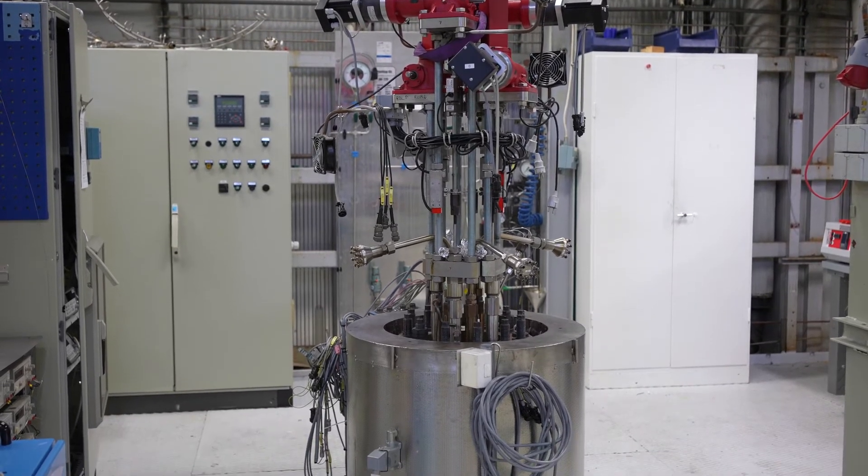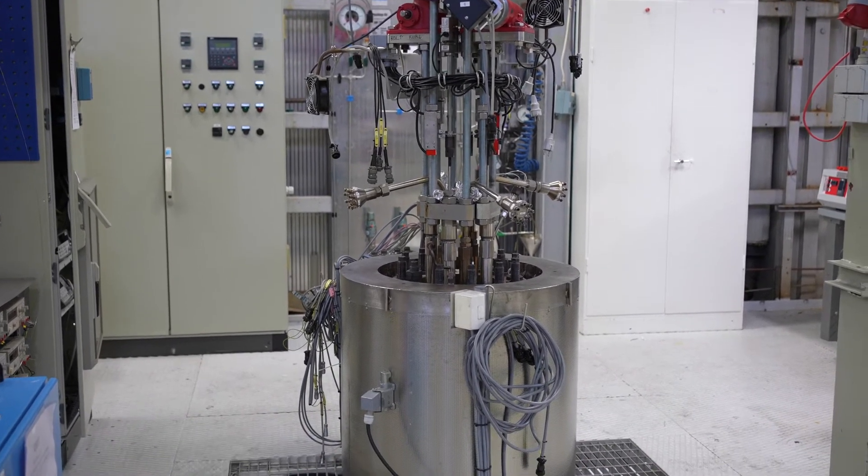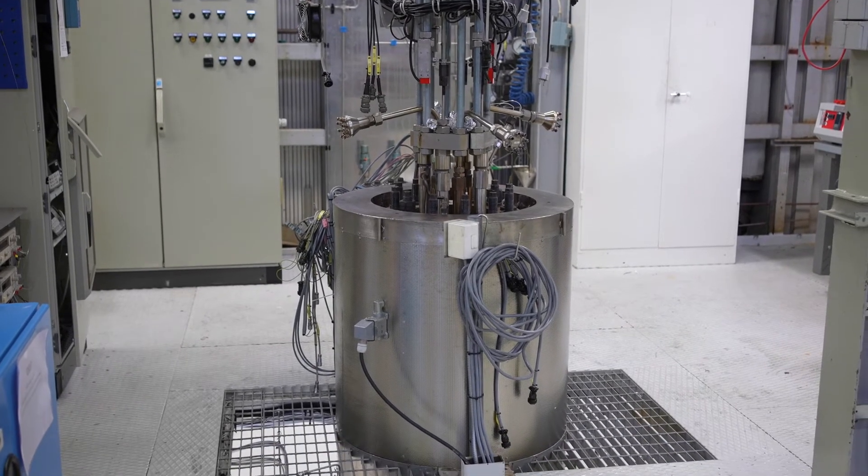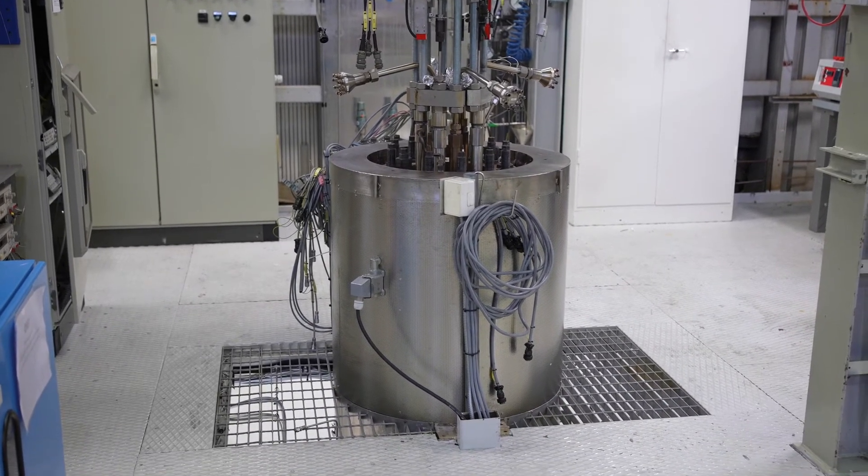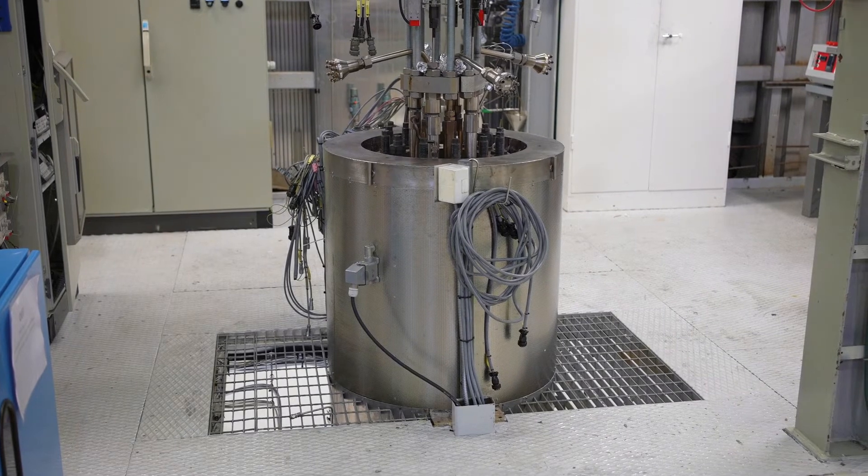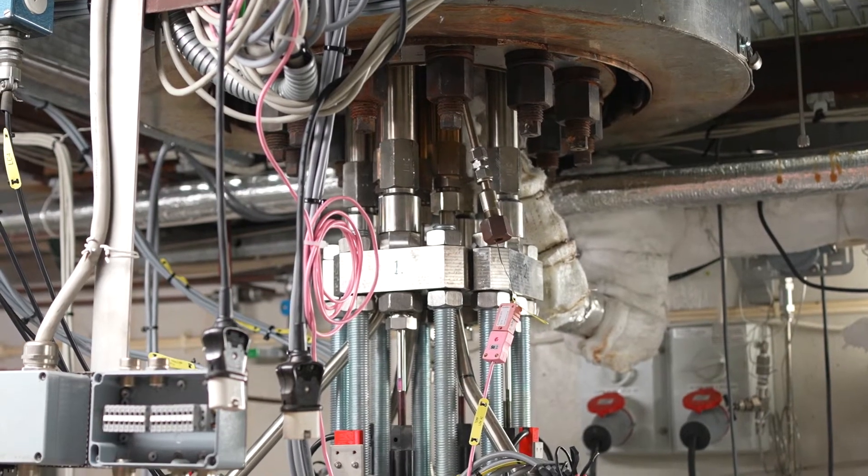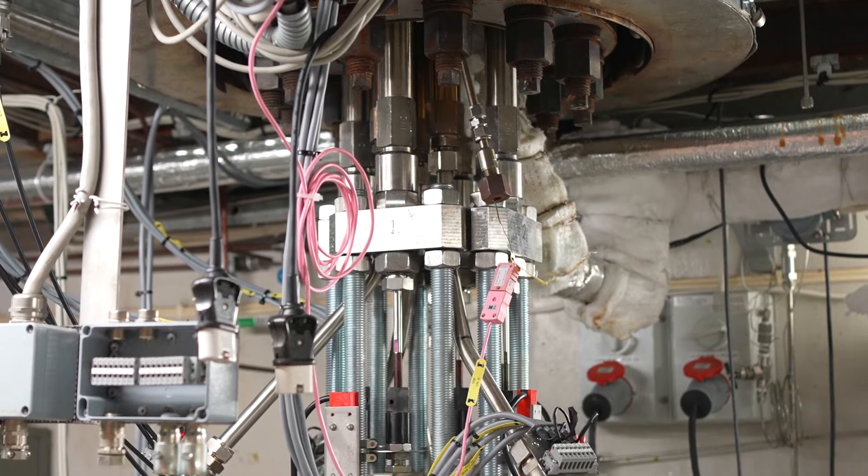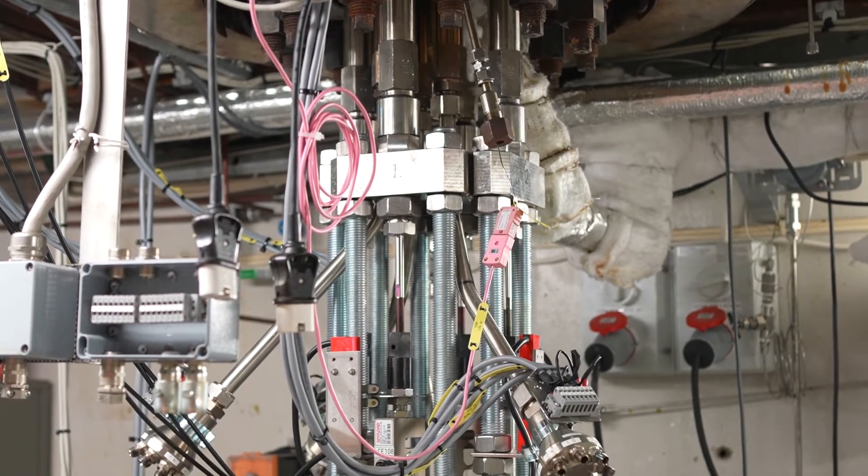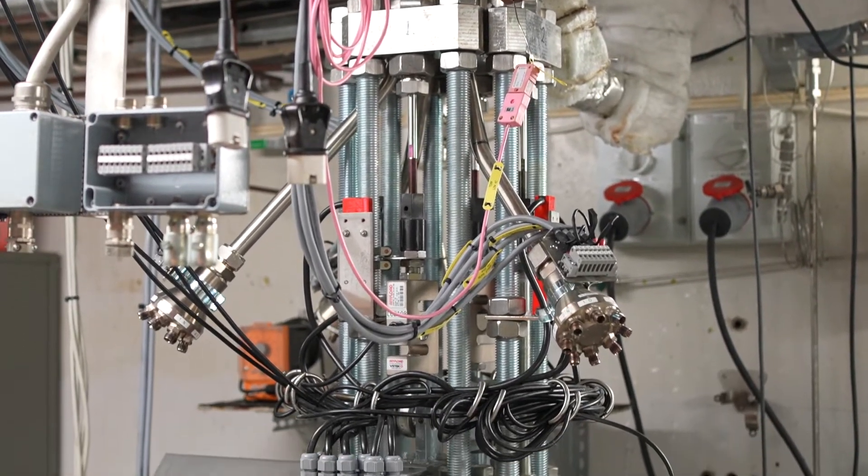This test system is designed for crack growth testing and is equipped with direct current potential drop for crack length monitoring. The autoclave has a free volume of 37 liters, and with a total of 8 pole rods, it is capable of testing at least 8 compact tension specimens individually and simultaneously in water environments.